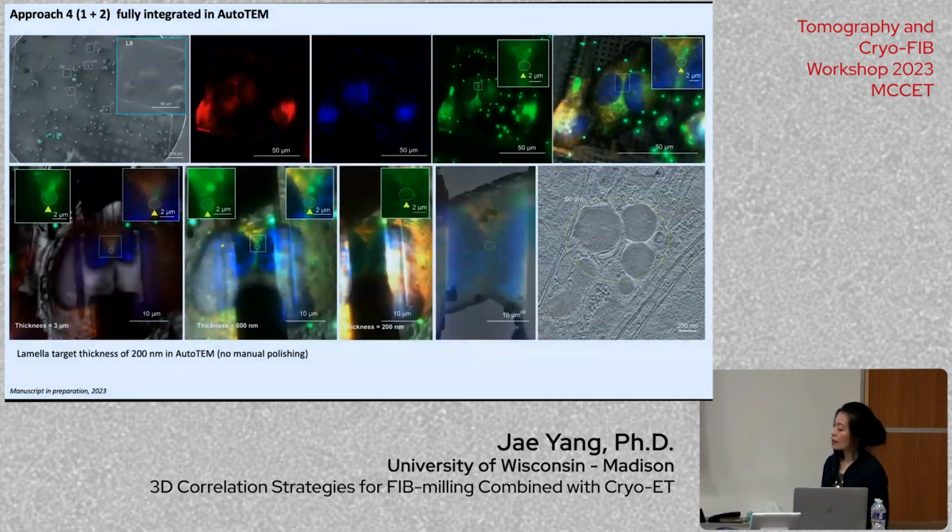This is a normal example that we used. We were targeting lipid droplets because they're round and very clear, so they can tell us whether it's working. We targeted and moved using iFLM at each stage to confirm whether the ROI is there. If it's not there, we would not change it, because that defines the process. We moved through this way, and in the end we still have our targets of interest preserved in the whole process.